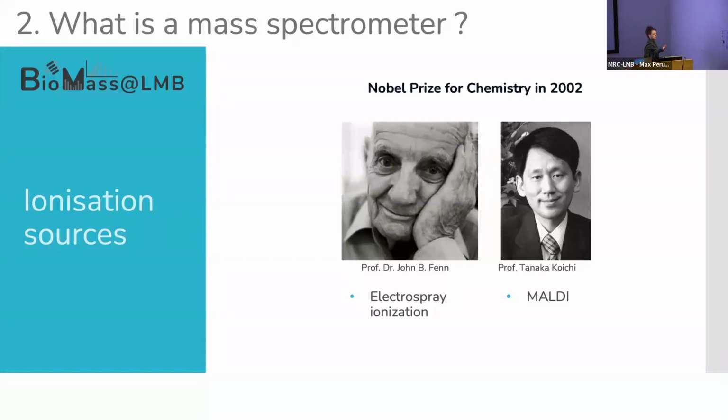Everyone was using MALDI ionization probably 20 years ago, when we were doing identification of proteins in gel bands. But now the community has used MALDI for a different type of analysis, such as MALDI imaging. You cut very thin slices of tissue and crystallize them with a matrix that absorbs the energy from a UV laser, and then the molecules get desorbed and analyzed once they hit the mass analyzer. Most of our proteomics downstairs is done by electrospray ionization, and this is how we analyze both peptides and proteins.